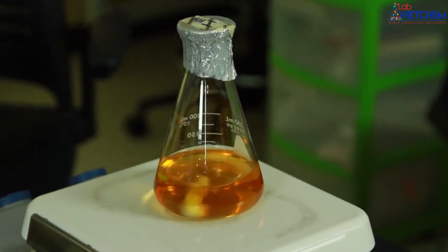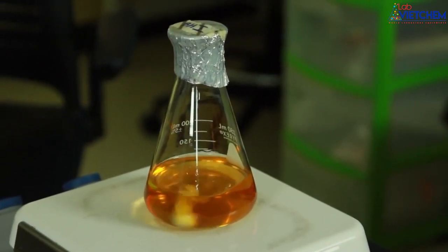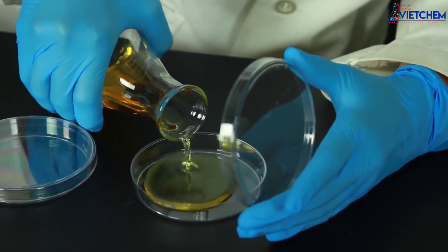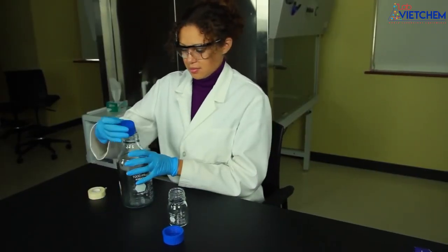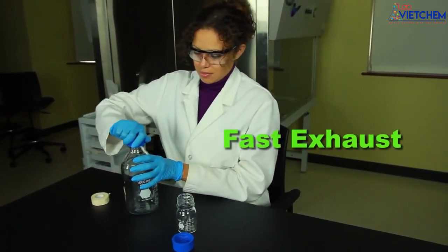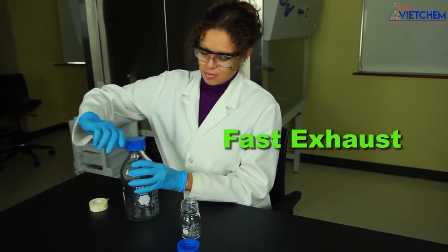Once the culture media has cooled to about 45 degrees celsius, it's ready to be poured into petri dishes. Now let's run a second autoclave cycle, this time using the fast exhaust to sterilize some empty bottles.